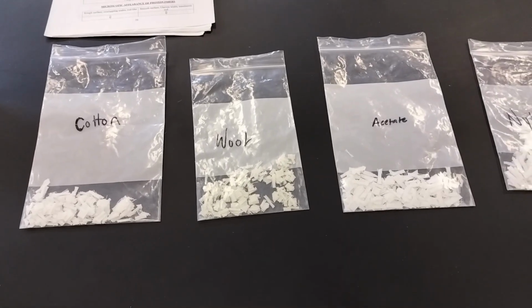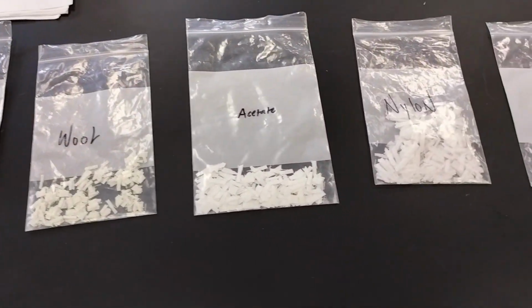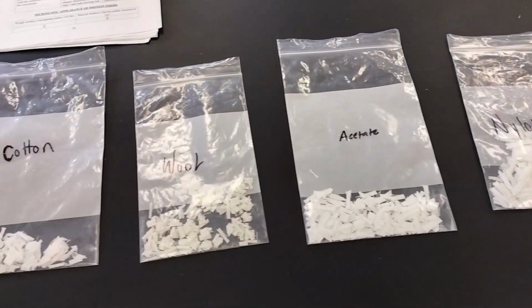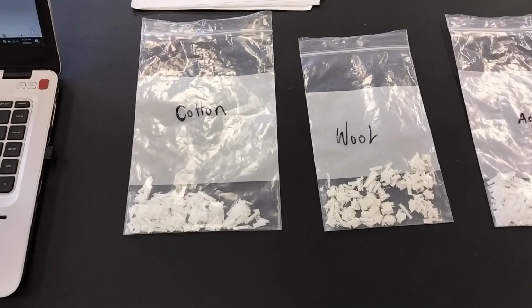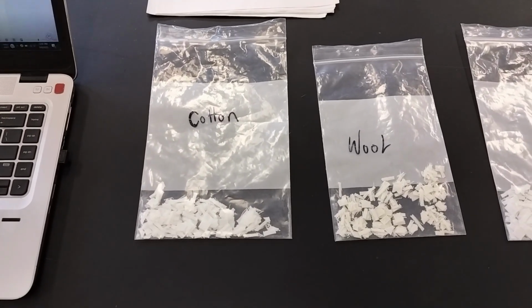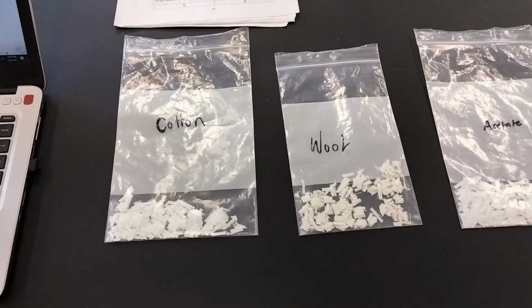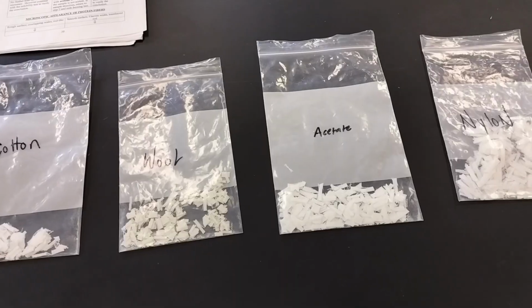Hello everyone. Today we are going to learn how to identify different textile fibers using various methods. You already know some techniques such as visual inspection, burning test, microscope observation, and staining test. Now we will focus on chemical testing.